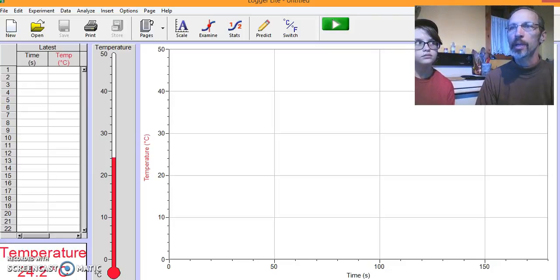I'm doing a chemistry lab experiment today. I have a high school chemistry student here. This is Josie. Hello. She happens to be my daughter. She's also a student, and I'm hopefully going to be a teacher, so I'll play the teacher and she'll play the student. So today we're going to be heating a mixture and observing how it behaves.